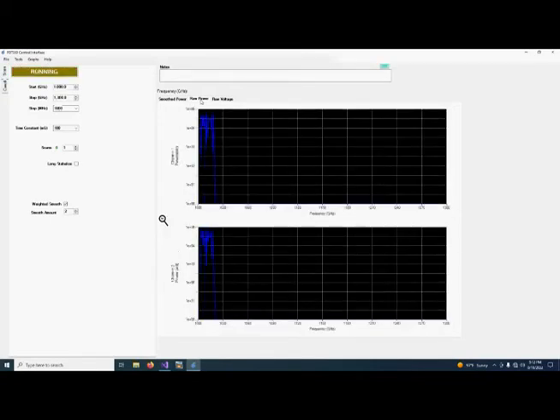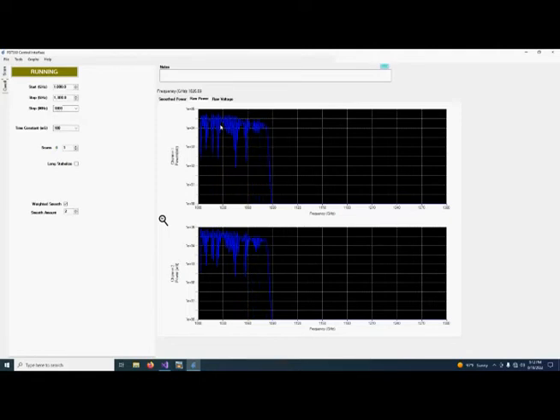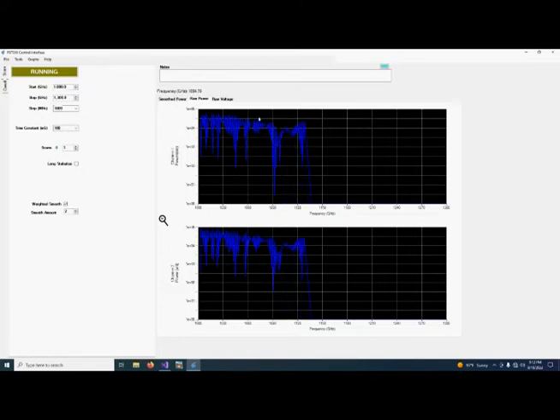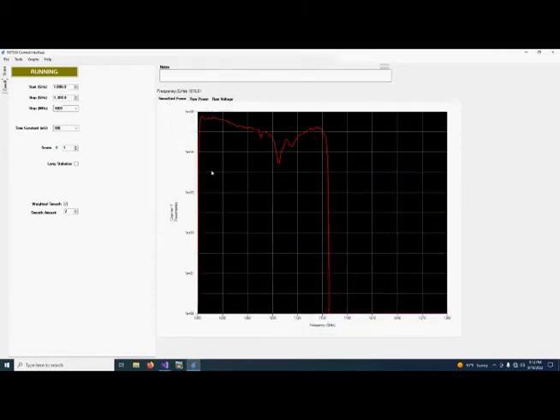So here, we have a very irregular fringe pattern. Like I said, we've moved the heads about 5 centimeters. And so the first and second harmonic though are still completely out of phase, 90 degrees out of phase. And when you sum them, again, you get a beautiful spectrum where there's no fringe pattern.